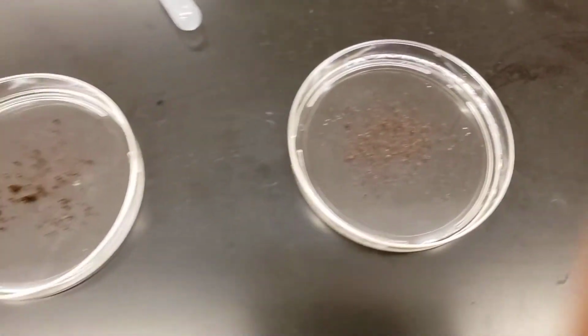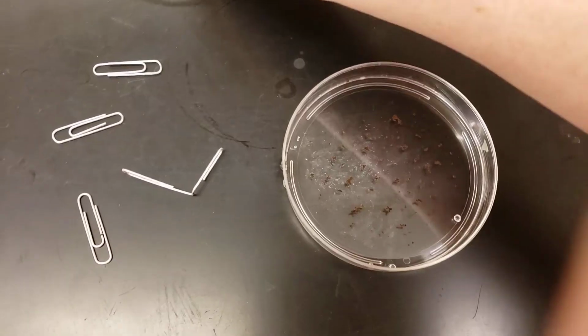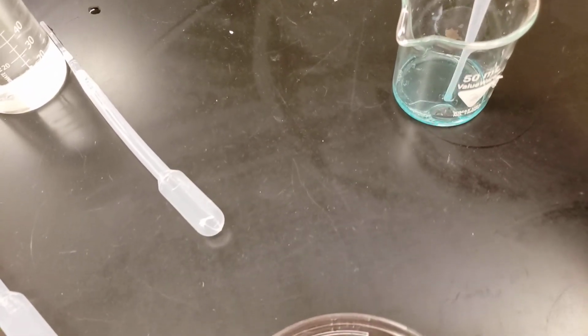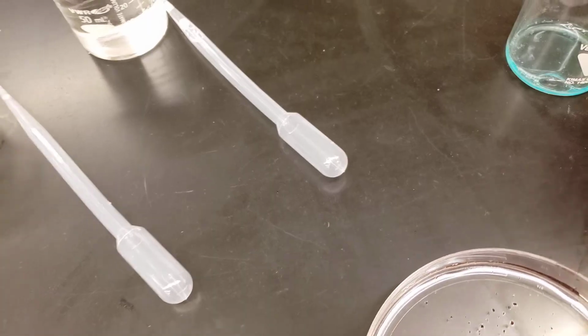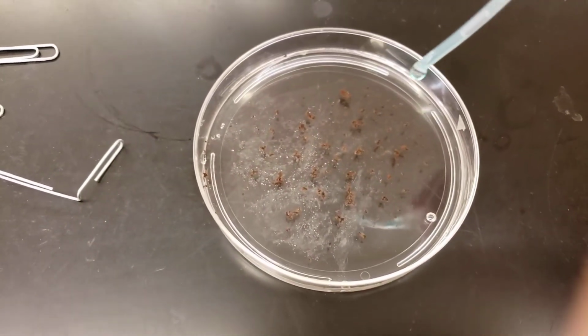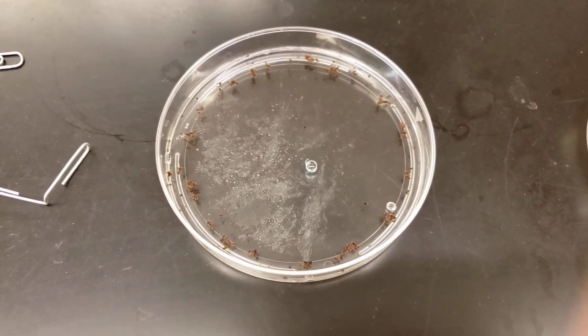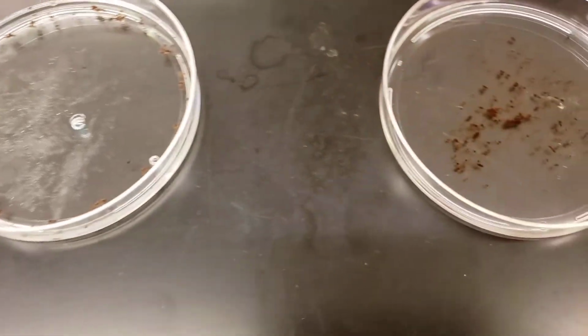All right, so now each of our substances has some flakes floating on top of it so we can judge the surface tension. Now we're going to break that surface tension with some of our dish soap. So starting off with the water, we are going to place a drop of dish soap in there and watch what happens. Okay, so we saw everything move to the outside. Think about the speed that it moved at.